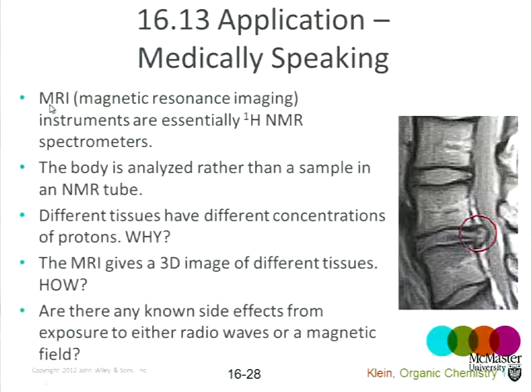Now, the recognition that different protons at different magnetic fields resonate at different frequencies allows you to apply NMR to all sorts of interesting situations. And so in magnetic resonance imaging, we are imaging the nuclei of, in fact, protons in your body, and essentially different tissues have different concentrations of protons, different amounts of water.